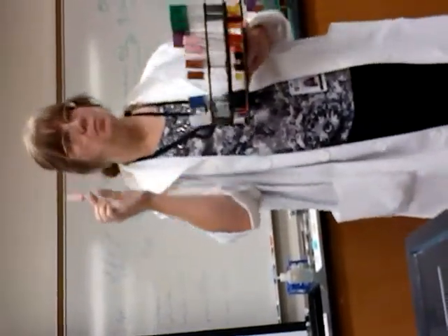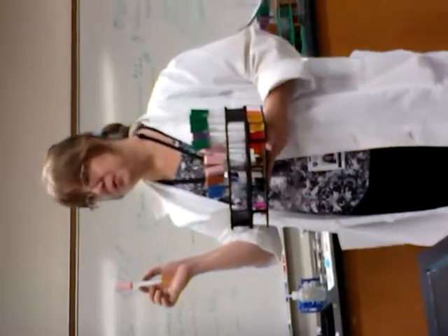KOH, creatine, alpha-naphthol. In the chemical reaction, they will detect what? Butanediol. If it's positive, you get a red ring at the top. If it's negative, it can stay green or straw colored, or no difference. I'll show some pictures of that later.